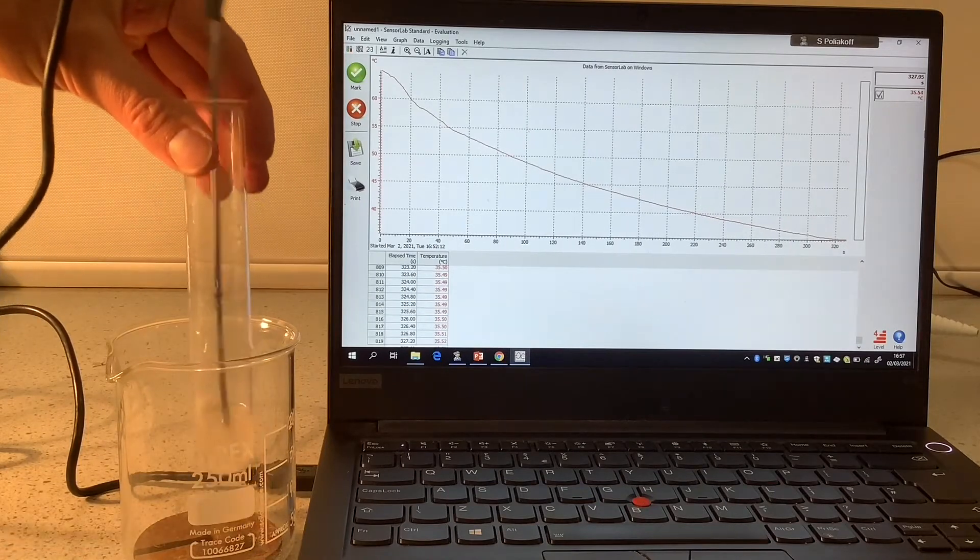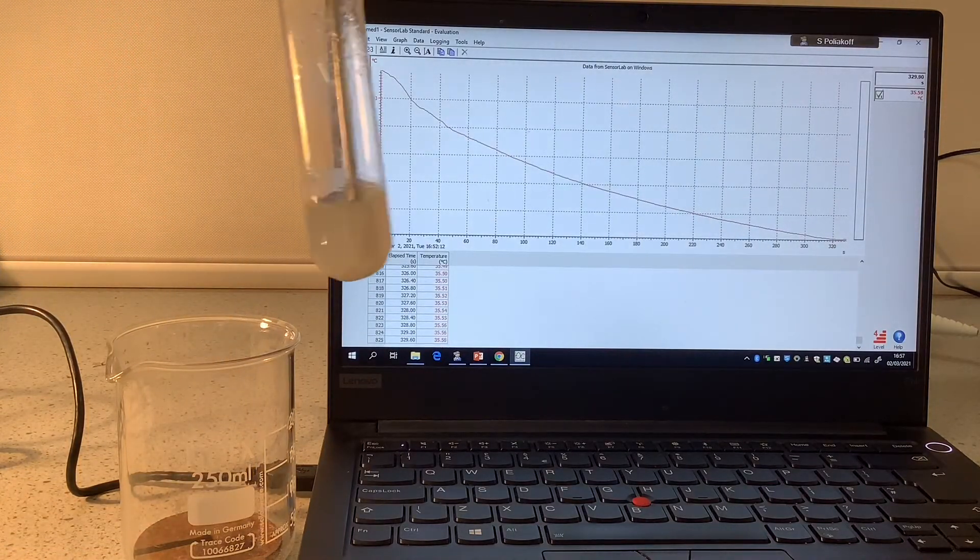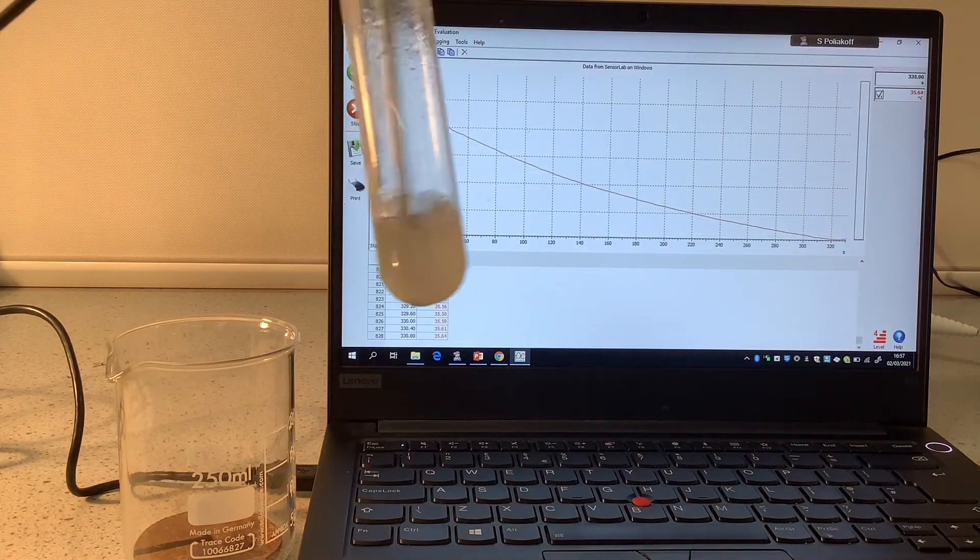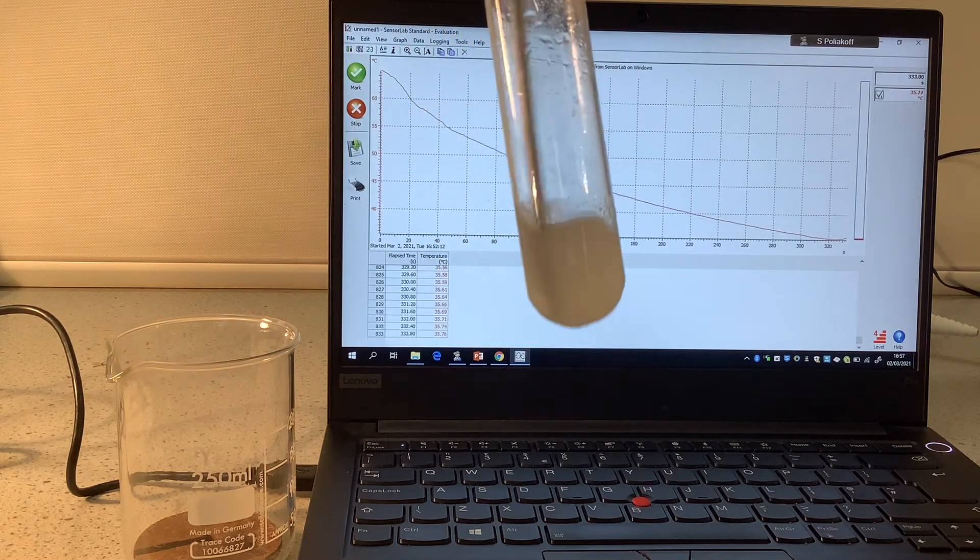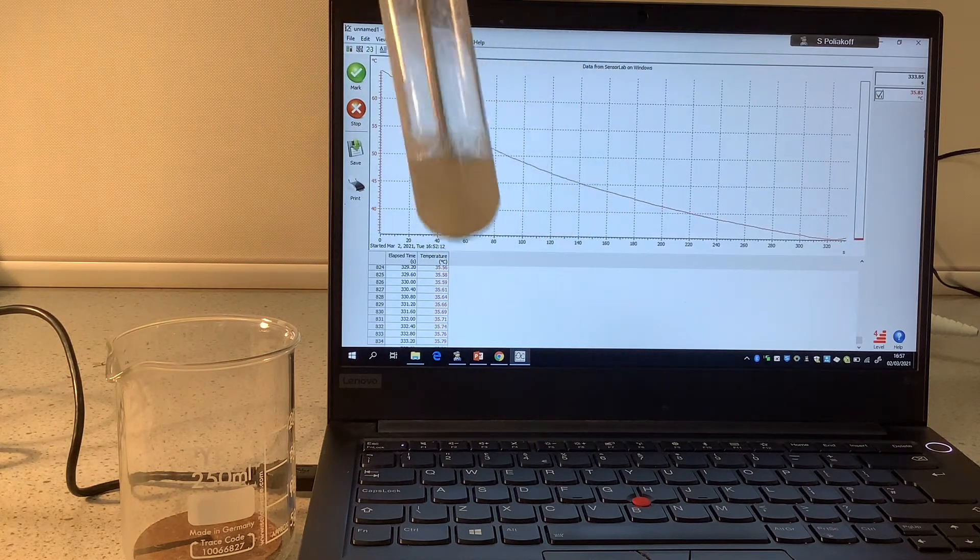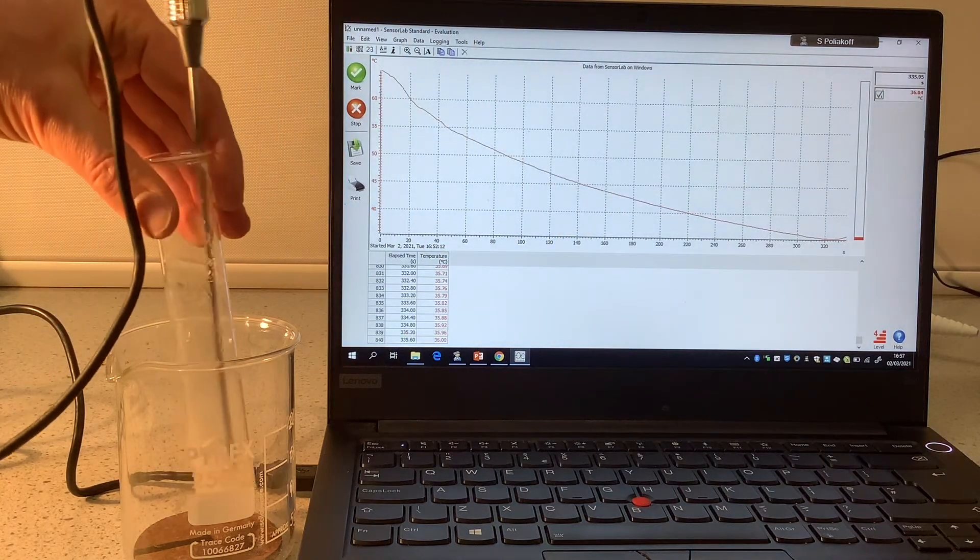Now I'm just going to take it out and bring it a bit closer and perhaps you can see that it's starting to solidify at the moment.